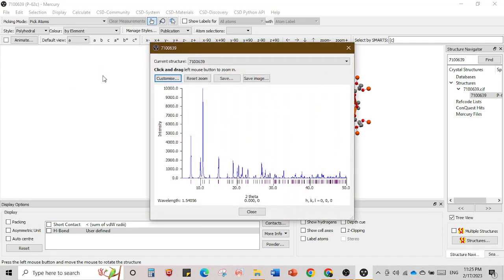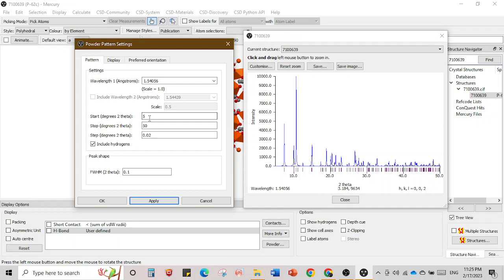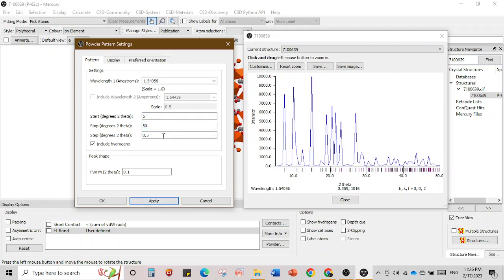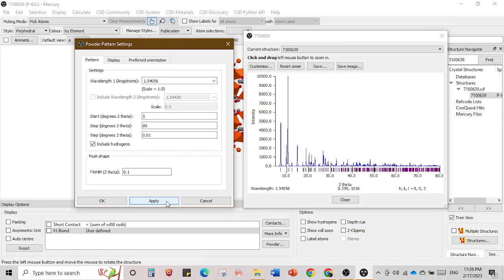One important thing: you can also calculate the powder pattern. Go to Calculate, select 'Powder Pattern', then click 'Customize'. Set the 2-theta range — for example 5 to 80 degrees — and set the scan rate, say 0.5. Set the wavelength you measured with; for copper K-alpha it is 1.54 Å. Click Apply and you see the simulated powder pattern. You can adjust to 5 to 50 degrees and apply.